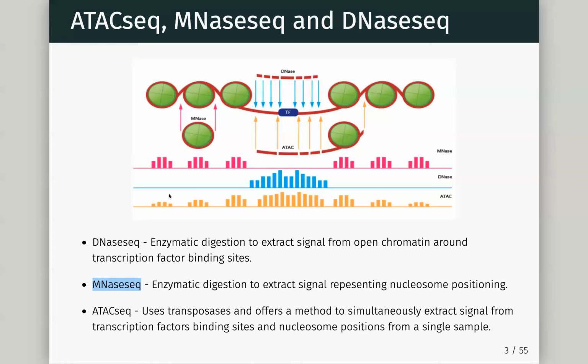So we should be able to, with this, get the position of nucleosomes, maybe, right, from this type of signal, but also get a map of where the open chromatin is, where our transcription factors may be binding. We might even get some signal reflecting the area which was protected because a transcription factor was bound to the DNA. So this is all cutting around areas which aren't covered or protected by other features on the DNA.